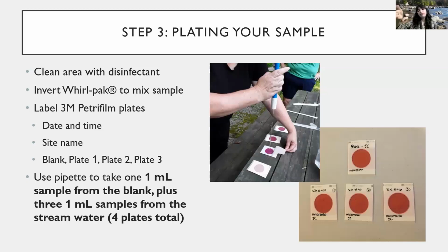And then when you're putting the cover back on, you want to just do it nice and slowly so that you avoid getting water off of the plate and onto the table.